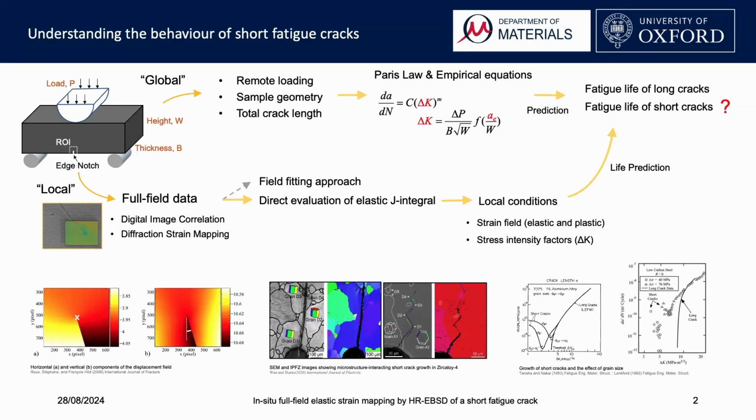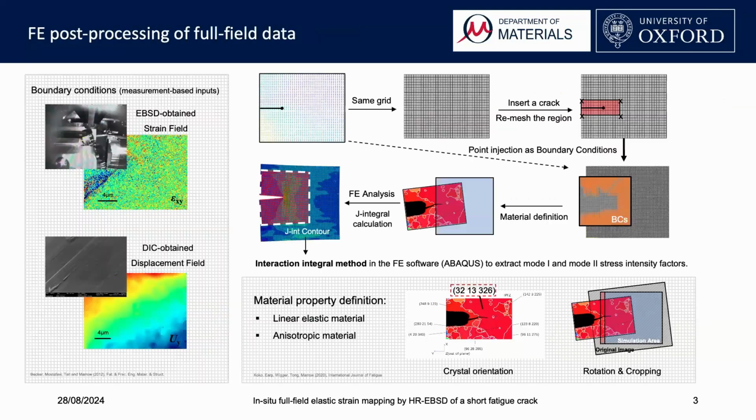field of view. And so we proposed an alternative approach, which is the direct evaluation of the elastic J integral. This method is more robust. We run finite element analysis based on full field data, and it provides a solid foundation for fatigue life prediction. This slide illustrates the workflow of our method.